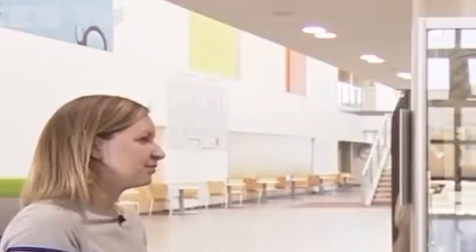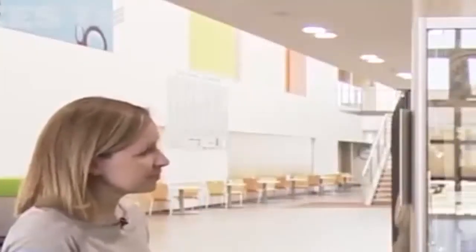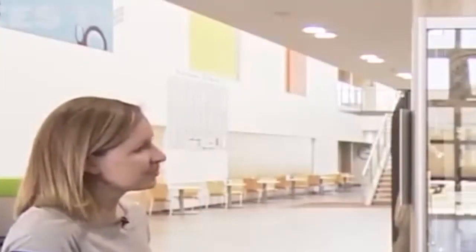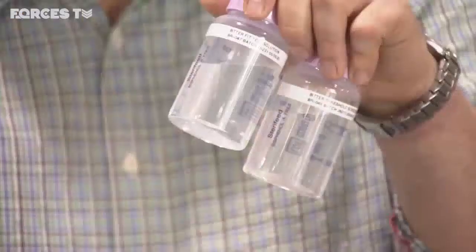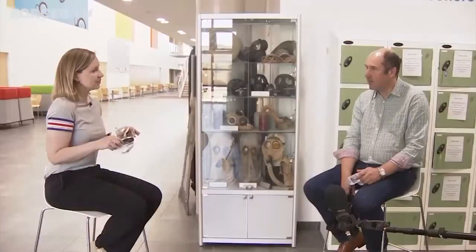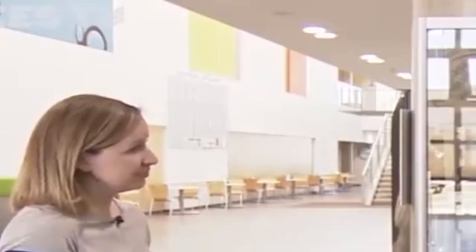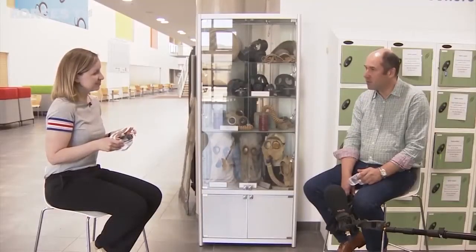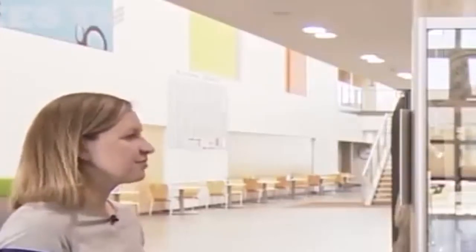It's not particularly difficult chemistry, if I may, but it's something that we're not used to doing here, and we had to establish a capability very quickly indeed in order to produce these solutions in extremis. So if I was working with somebody with COVID-19, I would put this on, tighten up the straps, make sure that everything's fitting properly, and then that solution, if I could taste it, it would mean that there was an issue with this fit. Yes, and we to date have manufactured about 21,000 units of fit test solution, and I'm reliably told that those solutions have enabled capabilities like the London Nightingale Hospital to become operational.